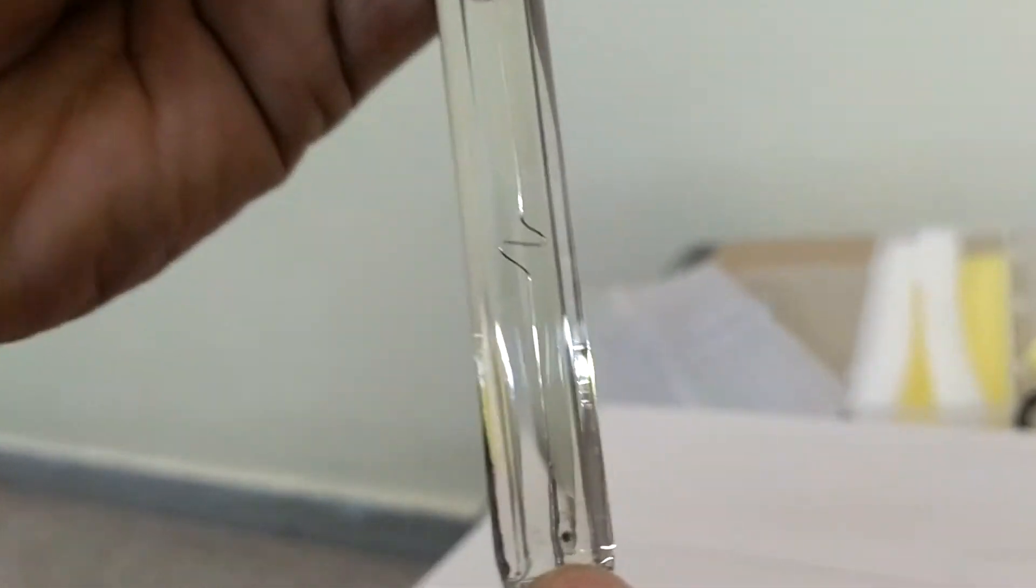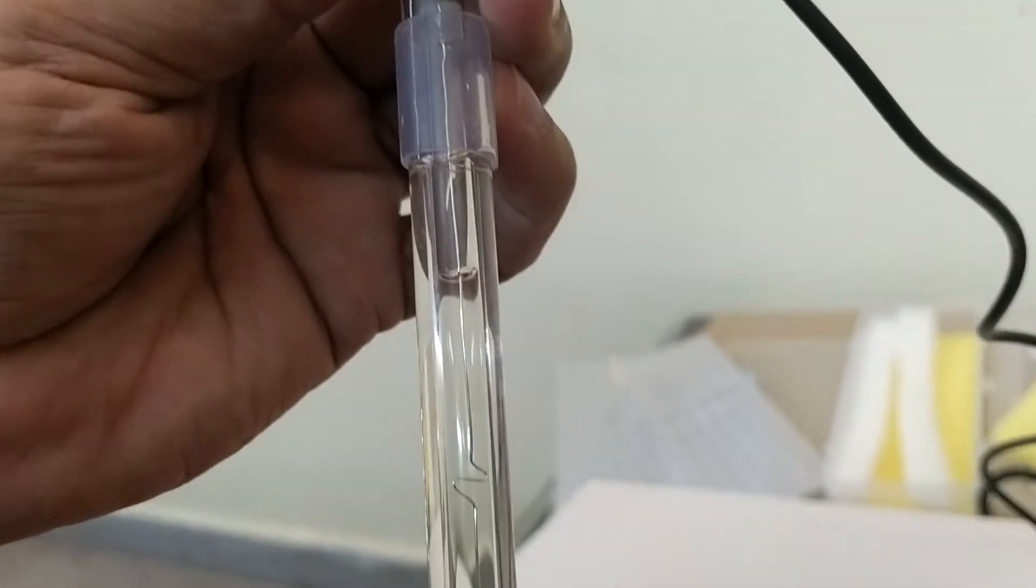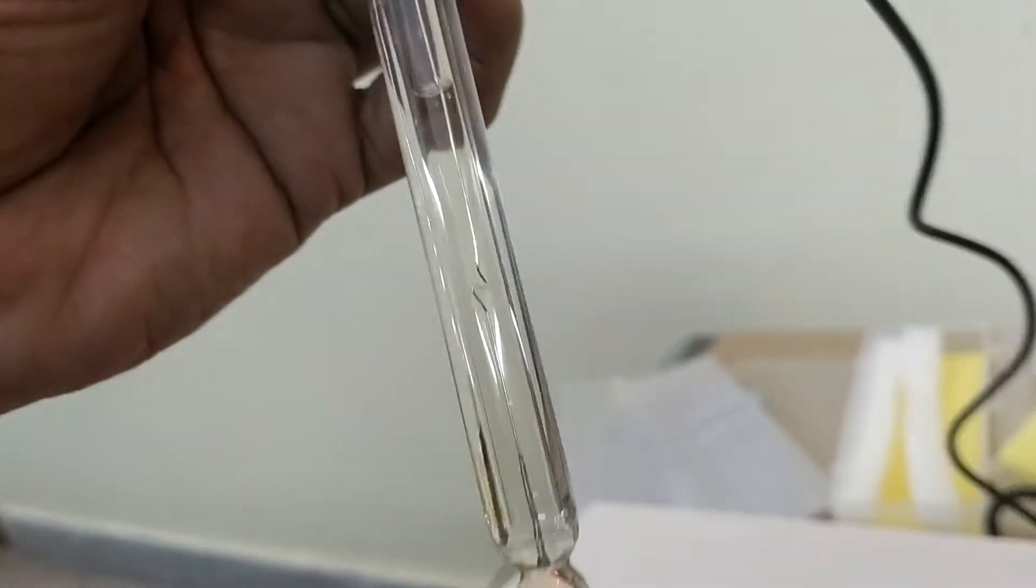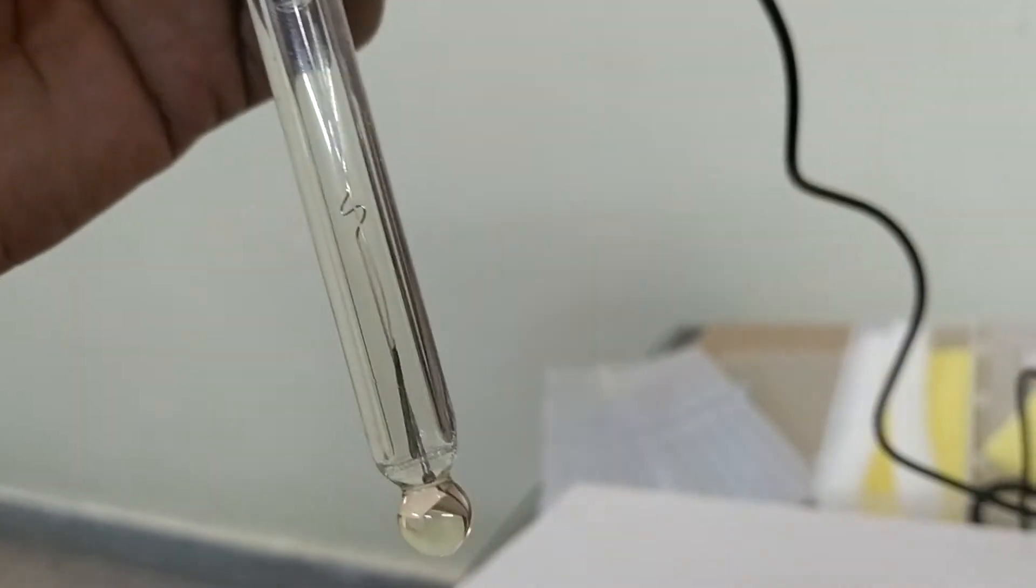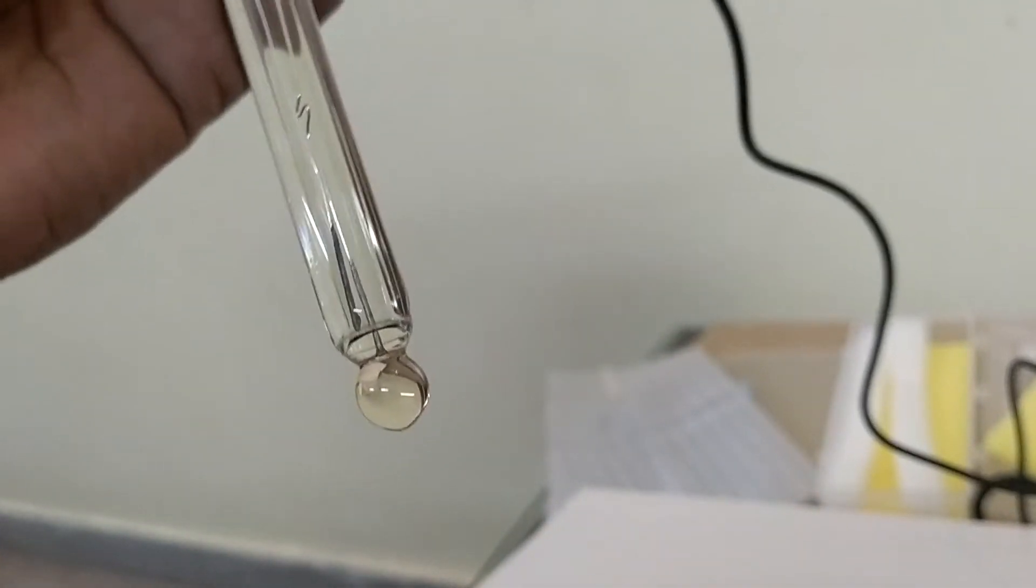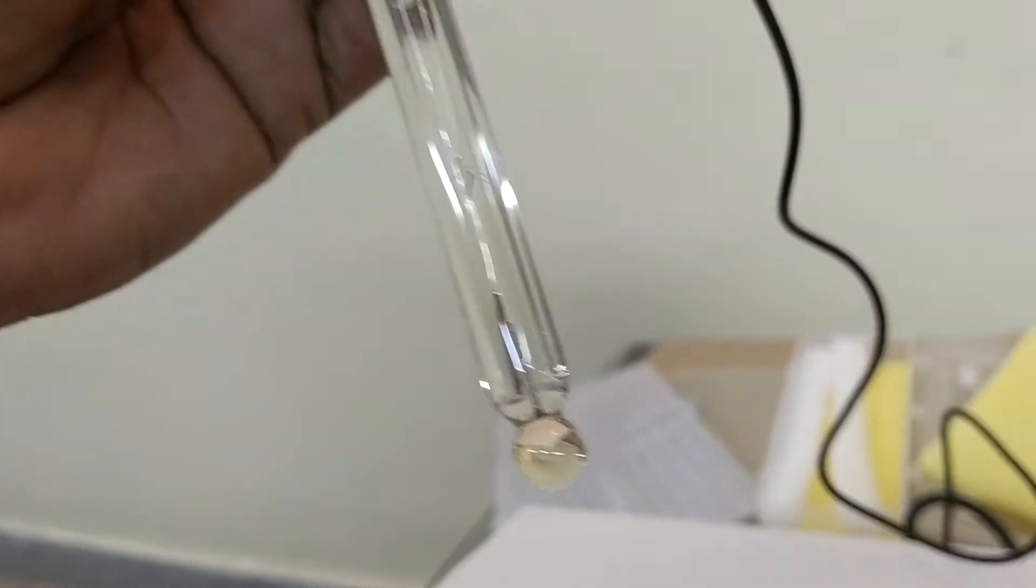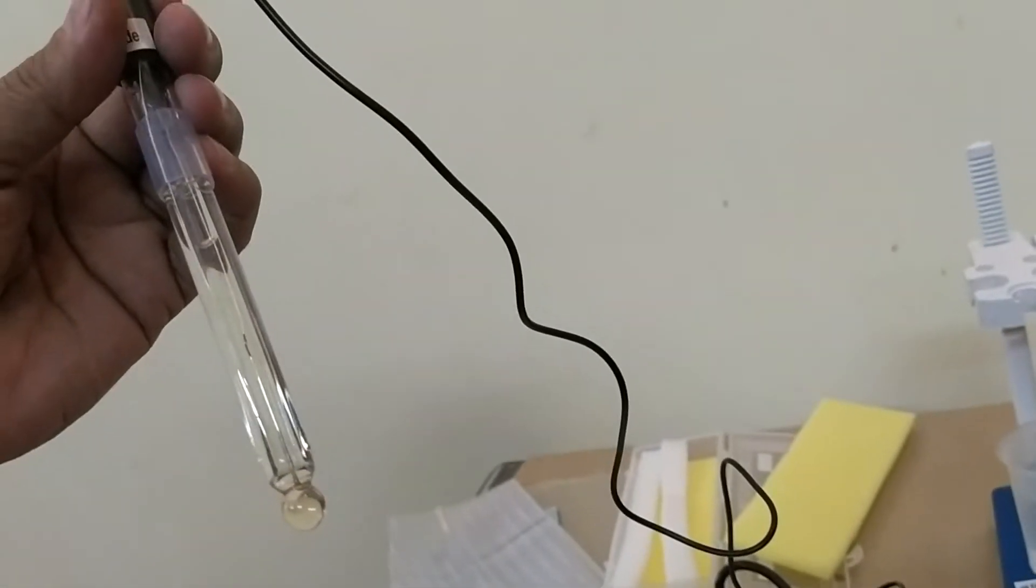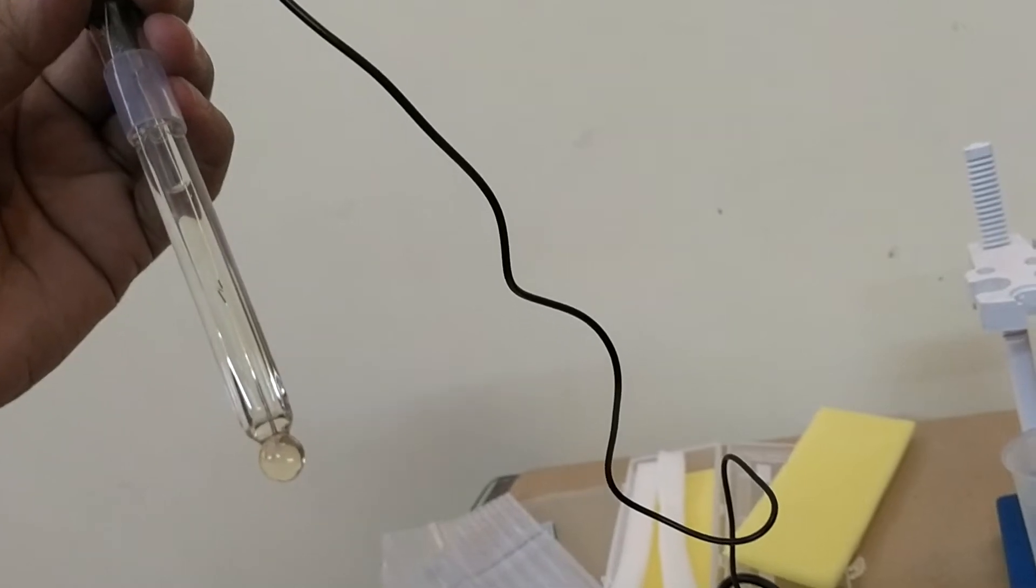In the pH electrode this is the main sensor. If this gets chalk, then pH electrode is dead. Always maintain 100% flow. When internal saturated KCL links with the outer solution, there is electric potential created that sends to Auto Digital pH meter.